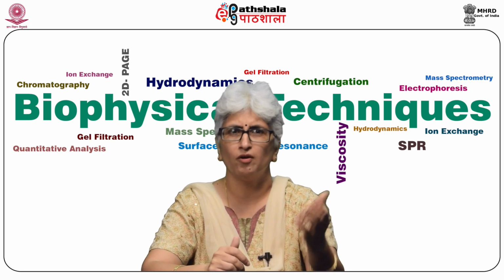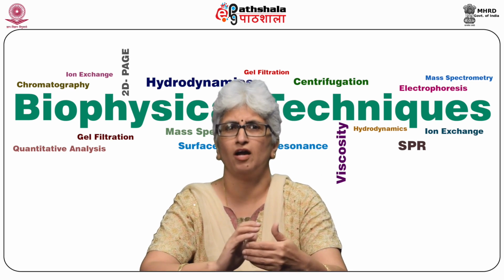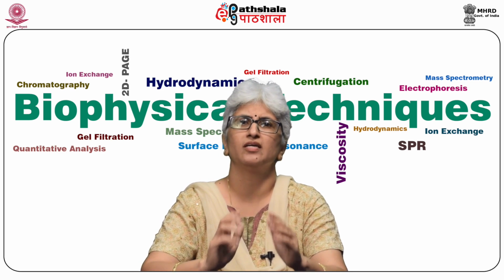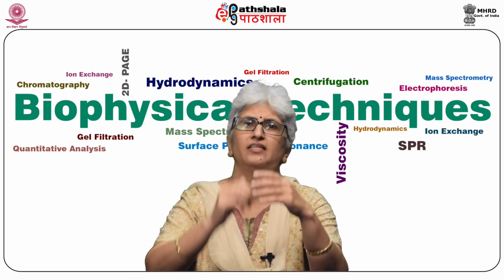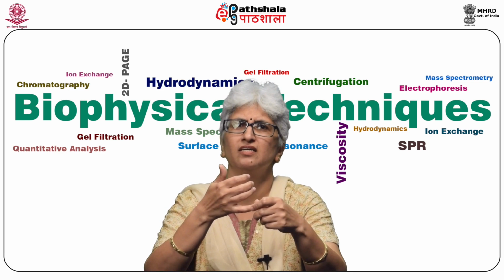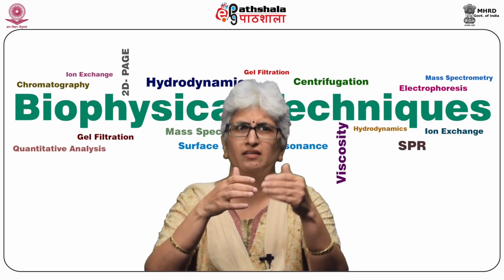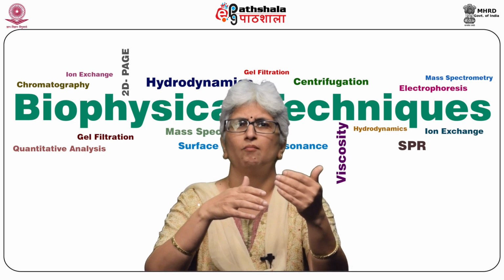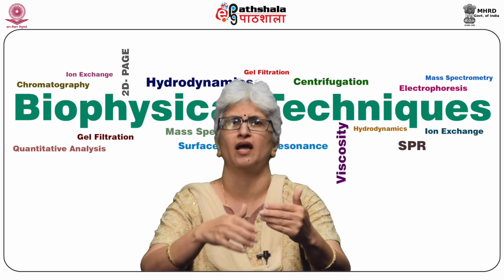The sample is then loaded onto the column, followed by column washing to remove unbound substances so that only the target molecule is attached to the affinity column. Finally, the target molecule is eluted either by changing the buffer conditions such as pH or ionic strength that destroy the interaction between target molecule and affinity ligand, or by adding a competitive molecule which has more affinity to the ligand.